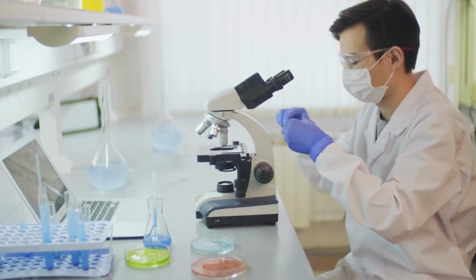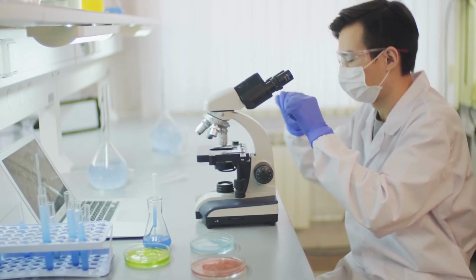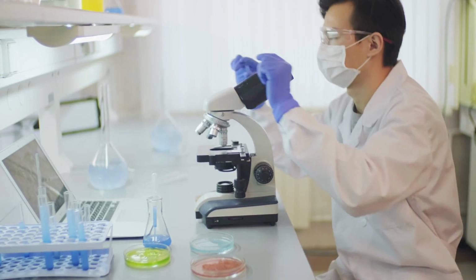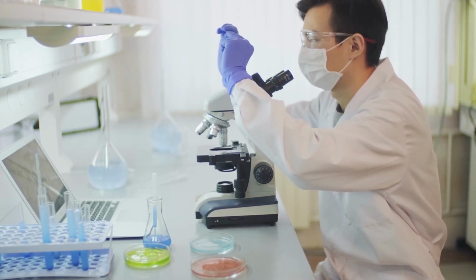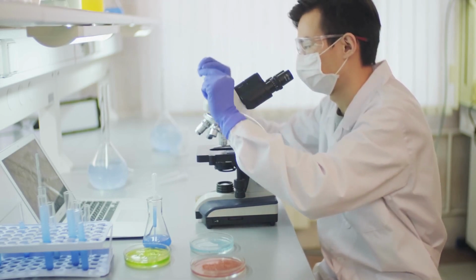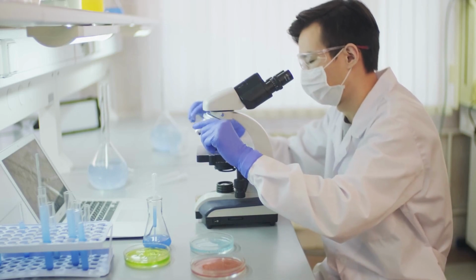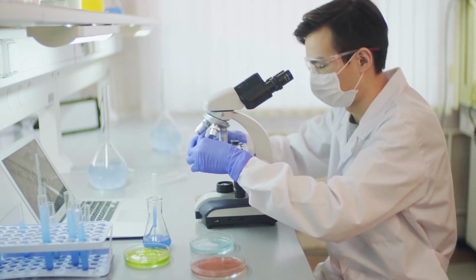To work on a microscope, a little practice is required. Here are general steps on the microscope. 1. Preparation. Ensure that the microscope is in a suitable and stable place. Make sure you have adequate lighting around the microscope, as you need good light for fine details. Make sure the samples you want to explore are under the microscope.